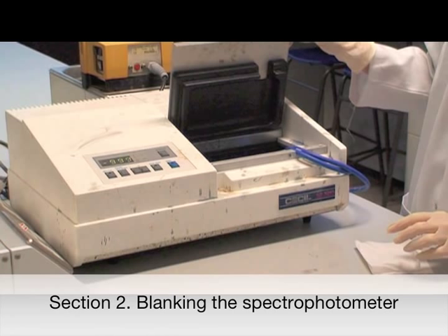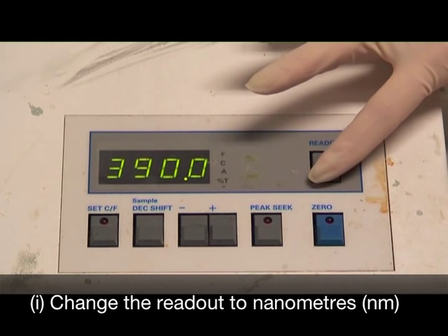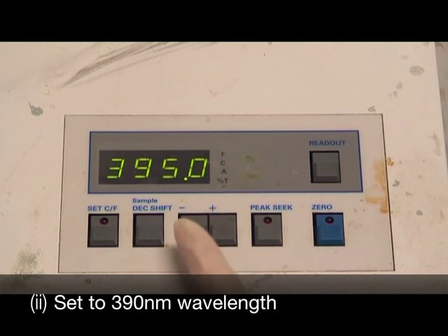Section 2: Blanking the spectrophotometer. Firstly, change the readout to nanometers. This has been abbreviated to nm. Now set the spectrophotometer to 390 nanometers of wavelength.